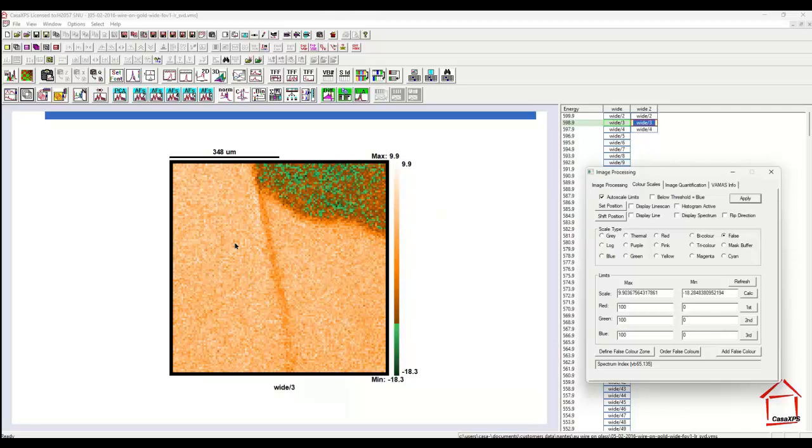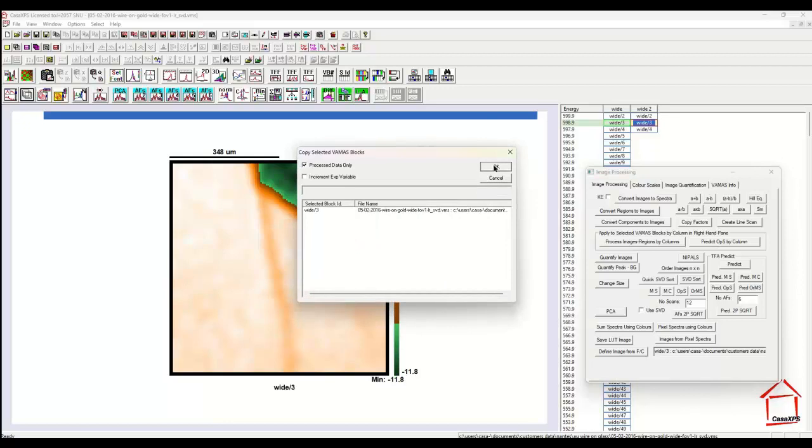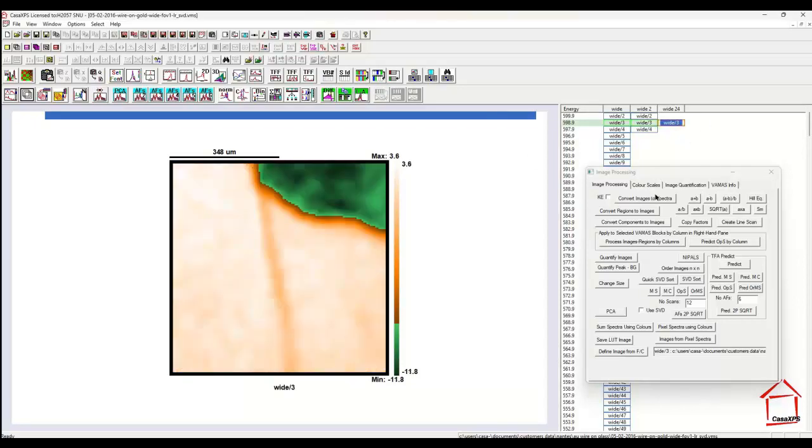and we can now see there's a good partitioning of these signals, but there is some overlap. So what I'm going to do before trying to partition is create a smooth of the image that will cause the zones to be more clearly delineated. So now I have a green zone that I think is silver dag, and all of this can represent the glass. I'll take a copy of that in the process form. So now I have a processed image that represents the smooth data. That's raw, this is now smoothed.